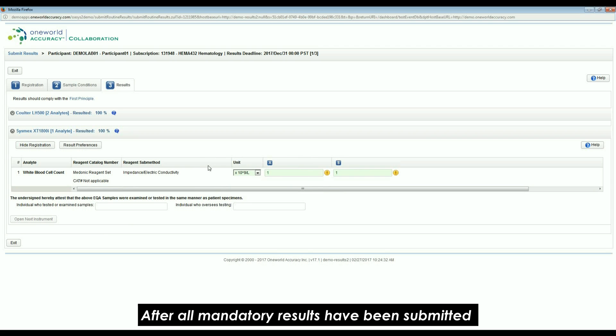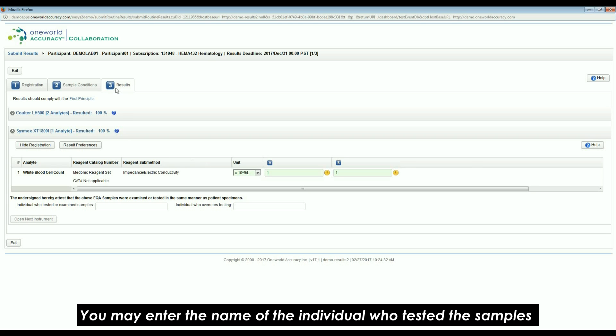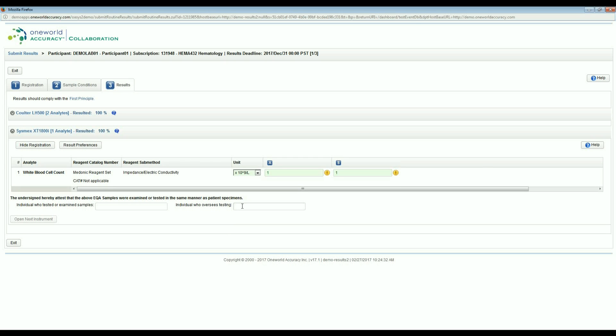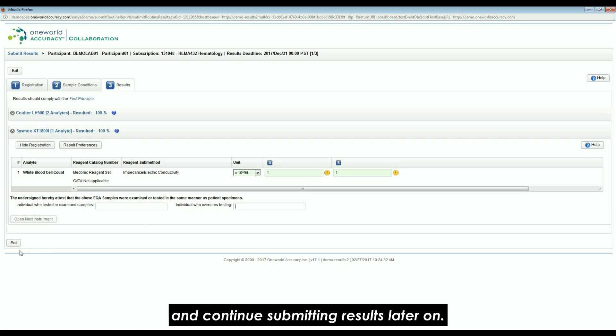After all mandatory results have been submitted, the results tab will turn blue. You may enter the name of the individual who tested the samples and the individual who oversaw the testing process. Please note that you may click on the exit icon at any time and continue submitting results later on.